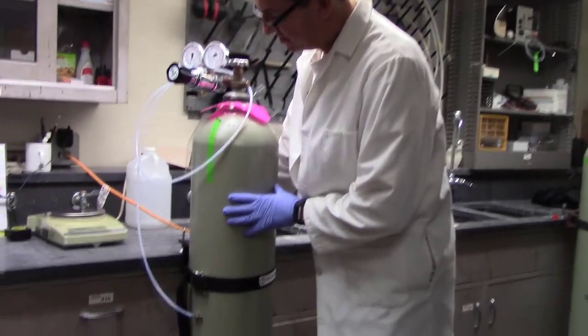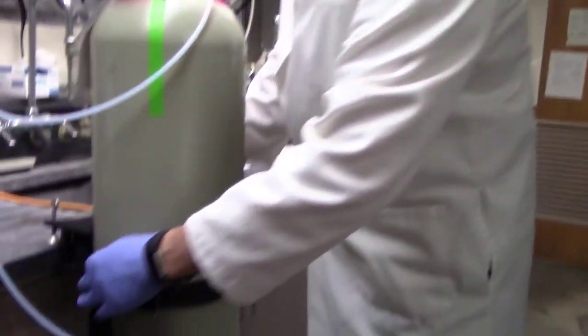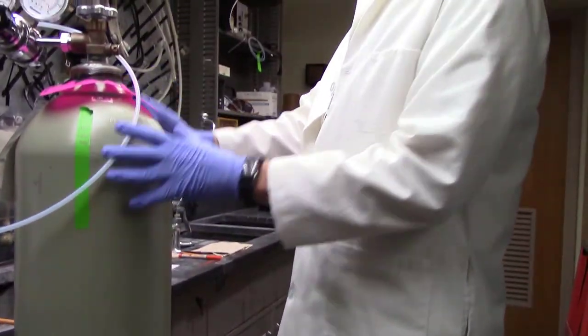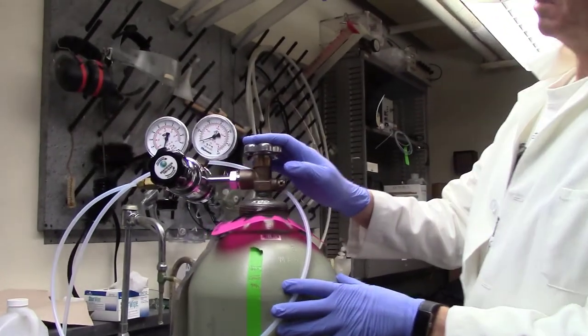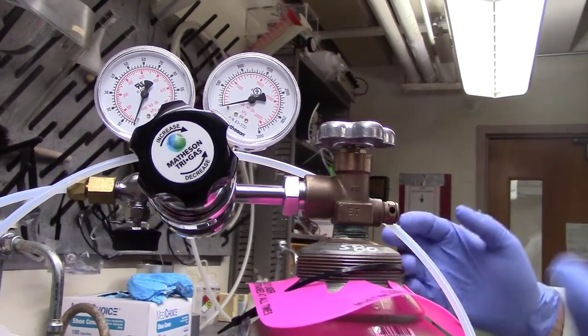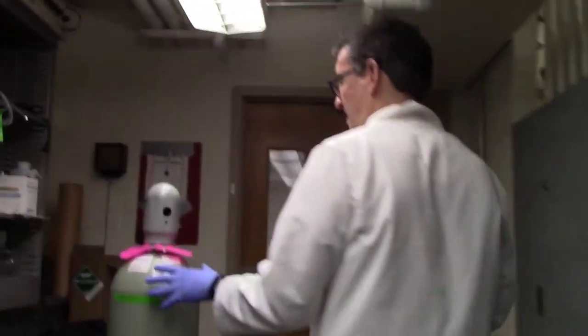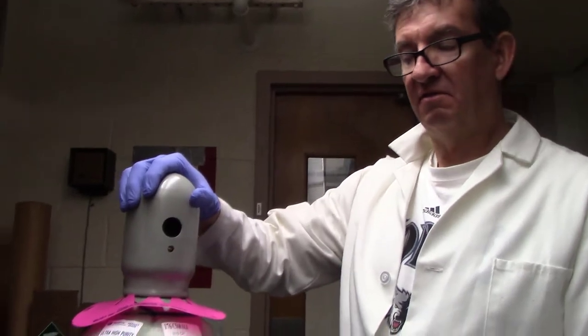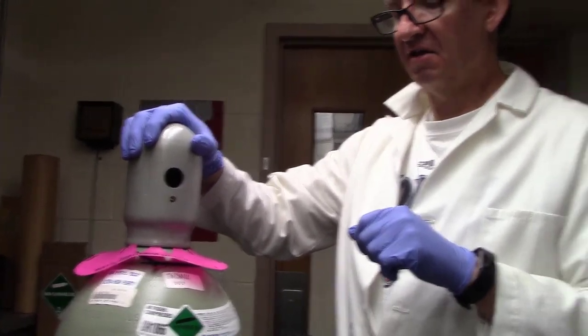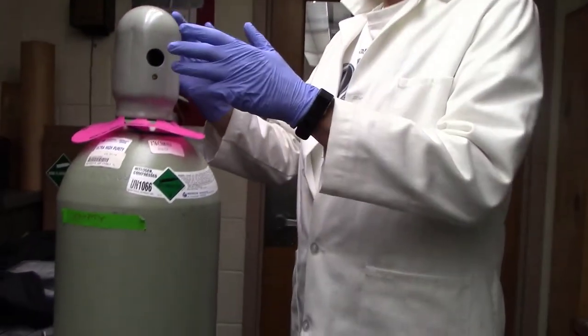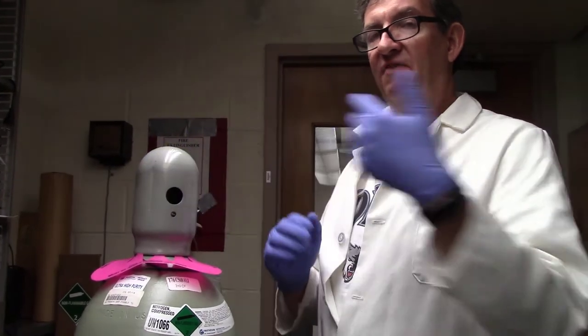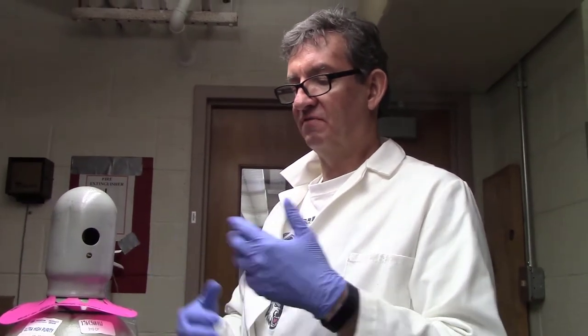The cylinders are properly attached to the benches. You have this clamp that goes on the bench and then the straps that go around the tank, and this tank has a regulator on it in order to regulate the pressure. That regulator will keep the gas from leaking out, and when you are using the tank frequently it's okay to have the regulator on it as long as it's strapped down. This tank which is not being used yet has a cap on it that protects the valve at the top of the tank when it's being transferred. So if this tank wasn't strapped and it fell over somewhere for some reason and this cap wasn't in place, then the valve could be knocked off, it could become a projectile because of the high pressure in the tank, and all sorts of injuries could potentially occur.